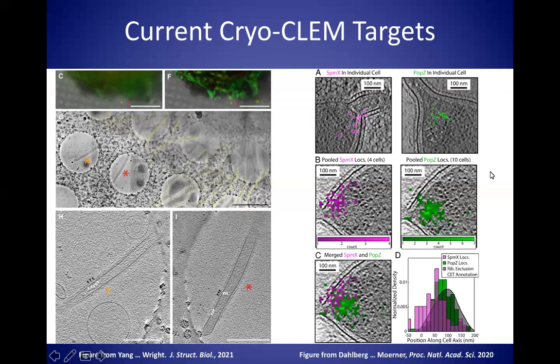What I think both of these cases illustrate is that cryo-CLEM currently is a pick-one-of-two approach. One technique will be dominant, the other will be supporting. And most of the time, as I said, the dominant technique is the one with the higher resolution, which is the electron micrograph.